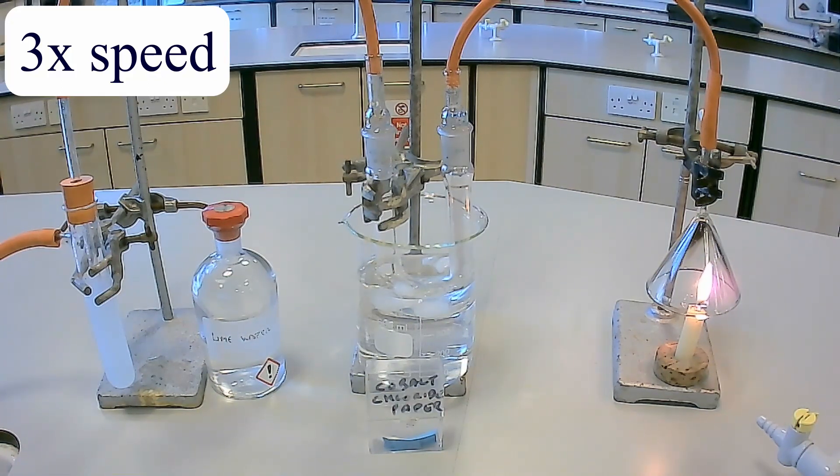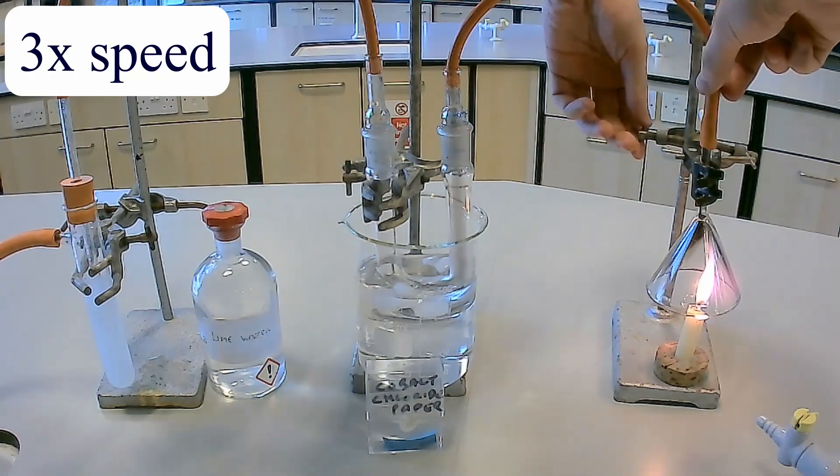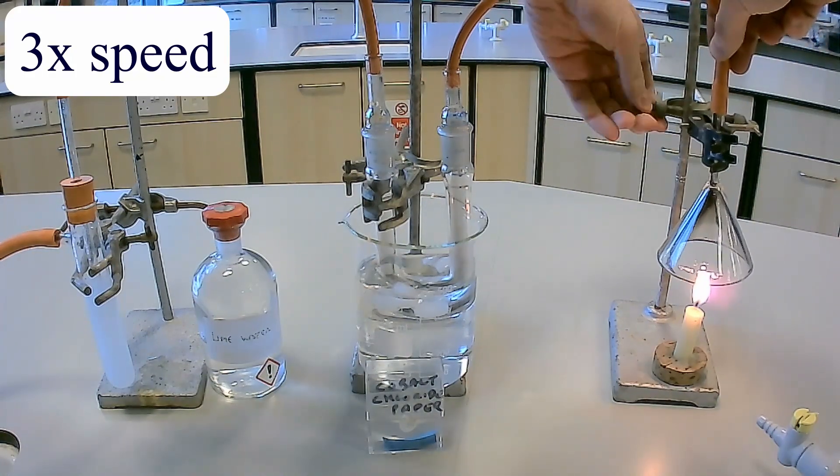Any water vapor in the tube will condense and turn into liquid water, which is then tested for by the cobalt chloride paper. The paper changing color from blue to pink indicates the presence of water.